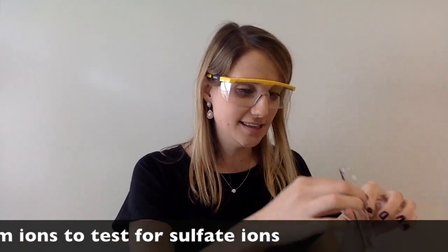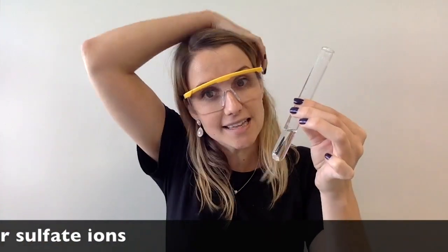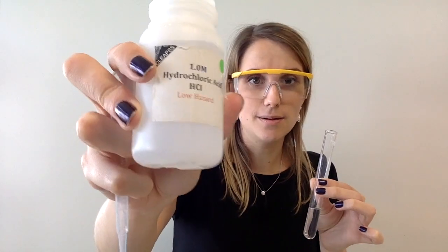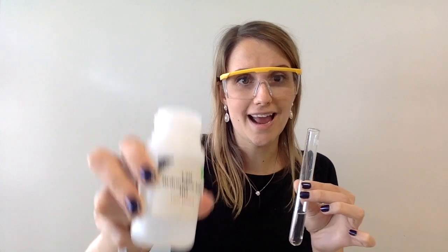So here is my sample which contains some sulfate ions. The first thing that I'm going to do when I'm testing is I'm going to add some dilute hydrochloric acid.